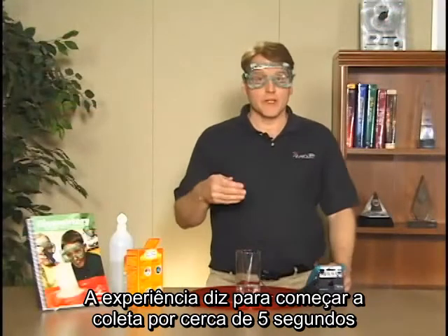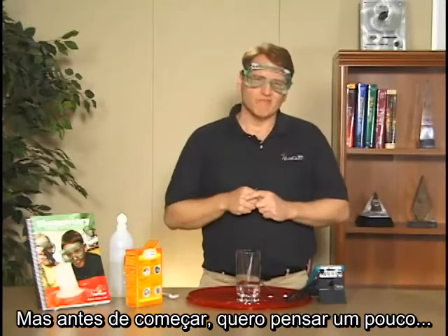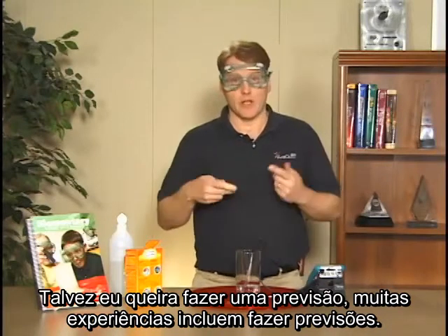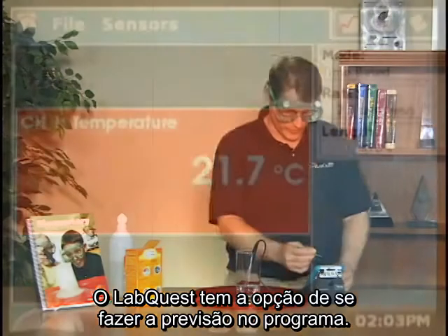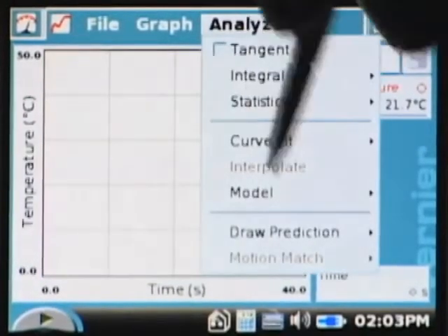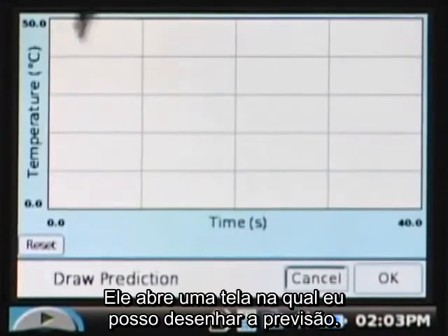The lab says to start collection for about 5 seconds before we actually add the other reactant there. But before I start, I want to think about this for a second. Maybe I want to draw a prediction. A lot of labs have you do predictions, and the Labquest unit has the ability to do a prediction on board there. So I can tap on my graph view there, and it's under Analyze. I can come down to draw a prediction, and it gives me a screen where I can draw the prediction.